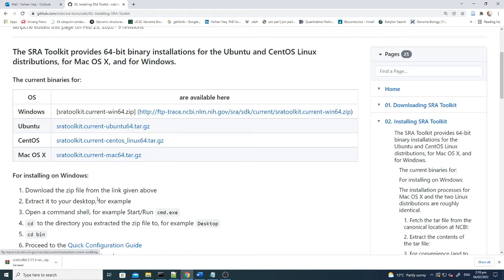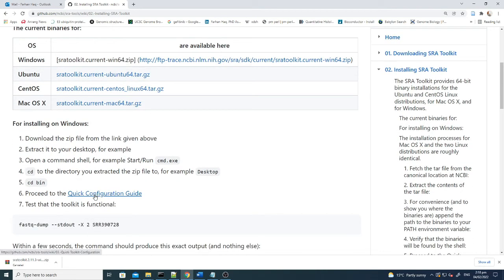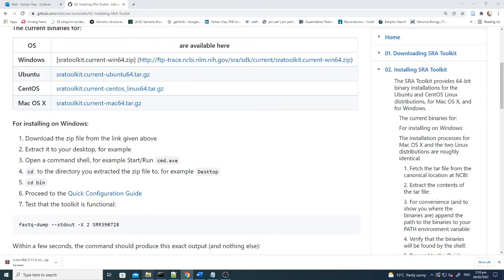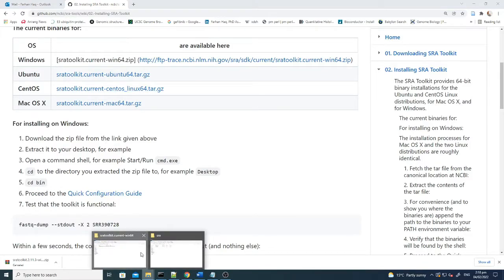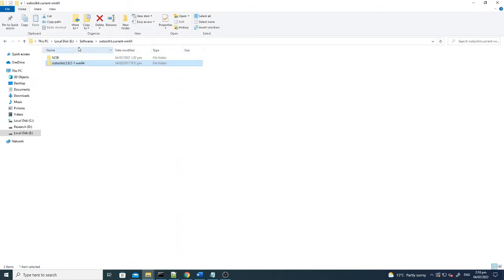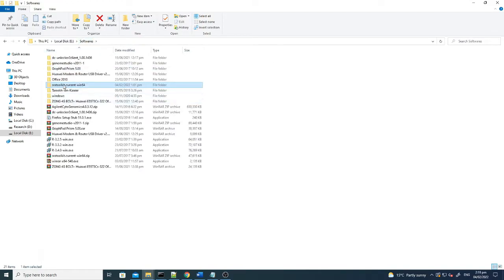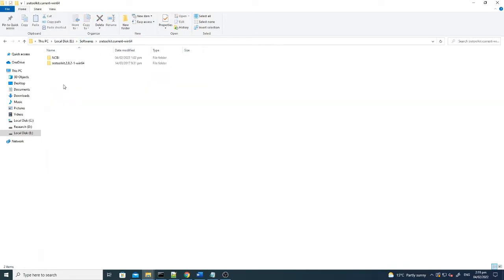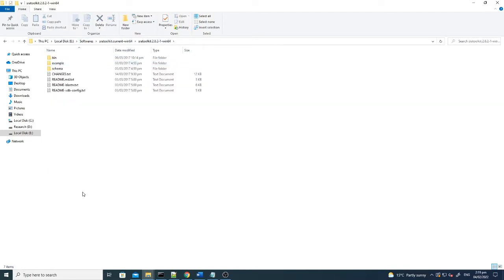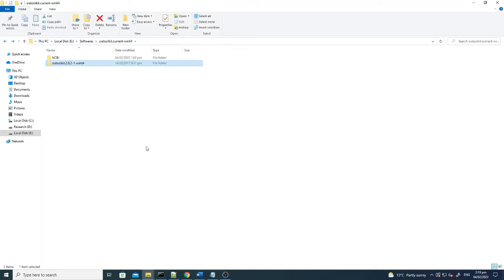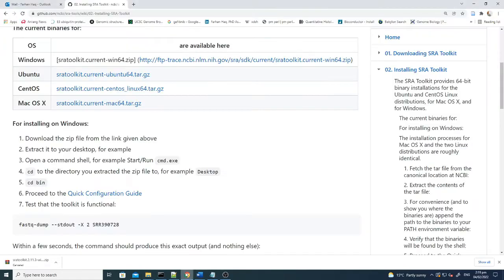After downloading it, you have to do a quick configuration guide. For instance, I have downloaded this in software folder. There is the SRA toolkit, and these are the unzipped files which were downloaded from here.